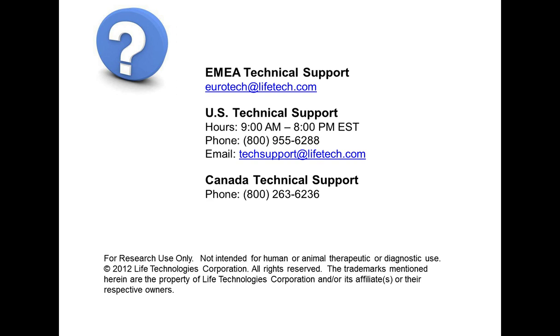Can you use flow cytometry to detect cells in different stages of the cell cycle? That's a really good question. We do have DNA content dyes that can give you a rough estimate of that. Of course, you can put those through probability software modeling programs to get a better idea. There are other dyes that can be used, such as the Fucci, which is a fluorescent protein, has two different readouts depending on the stage of the cell cycle. And then there are different antibodies that can be used in conjunction with a DNA dye.